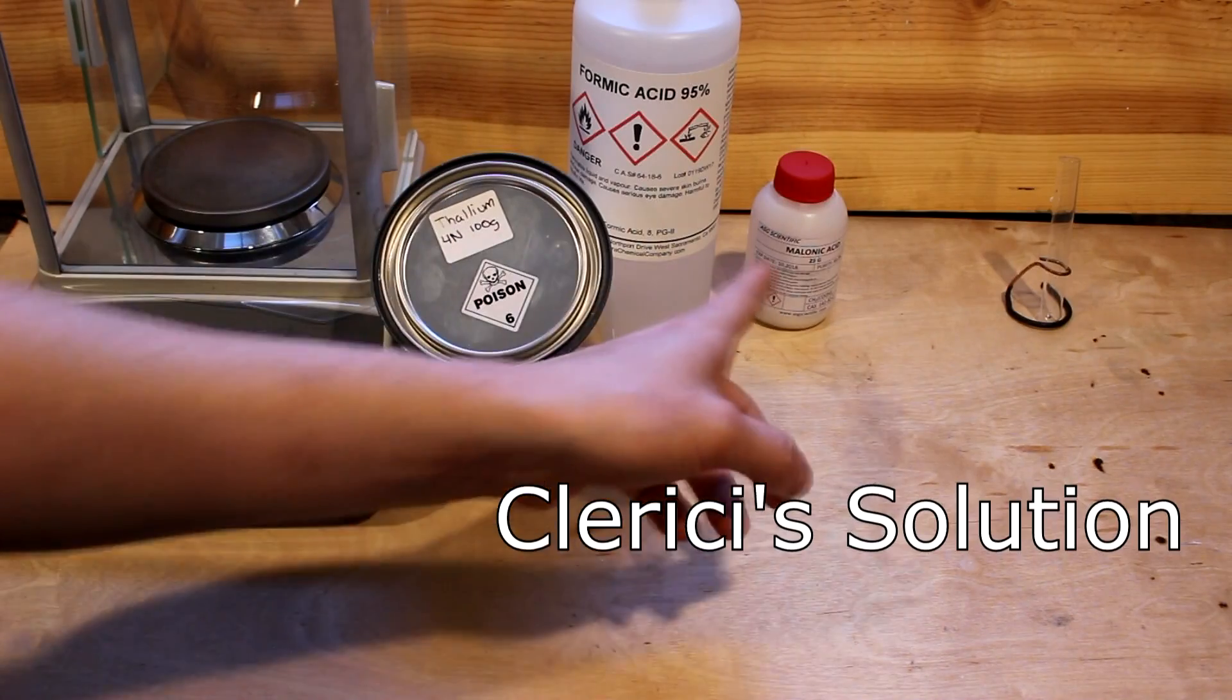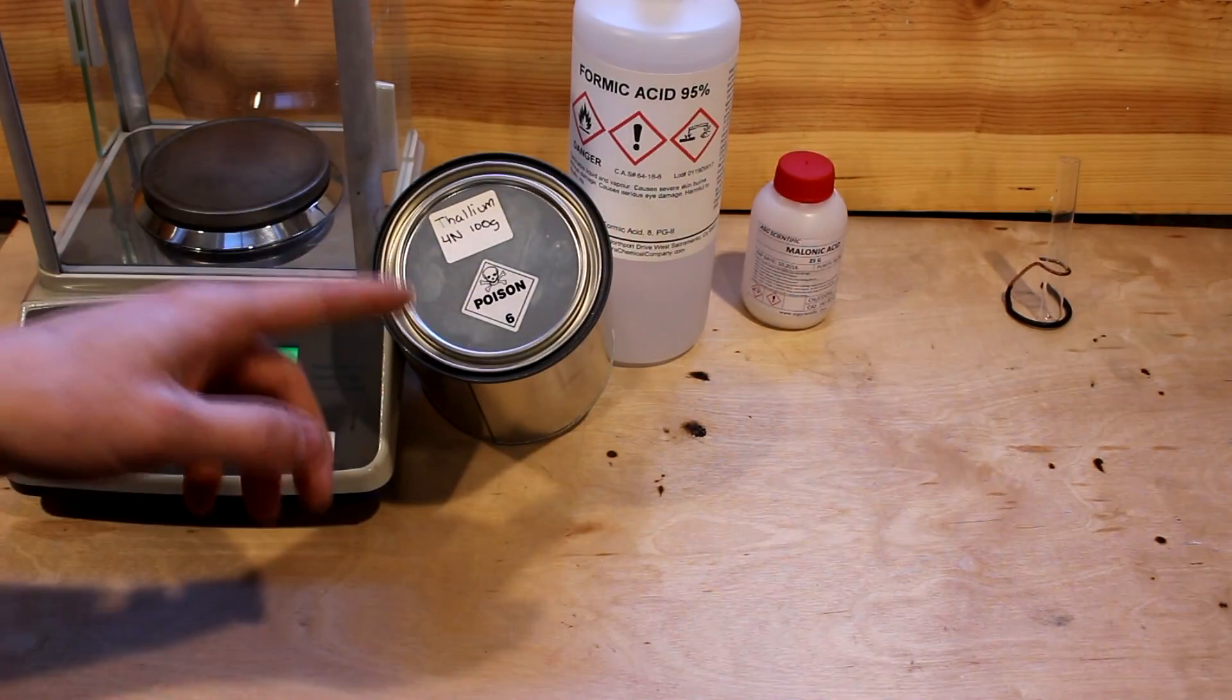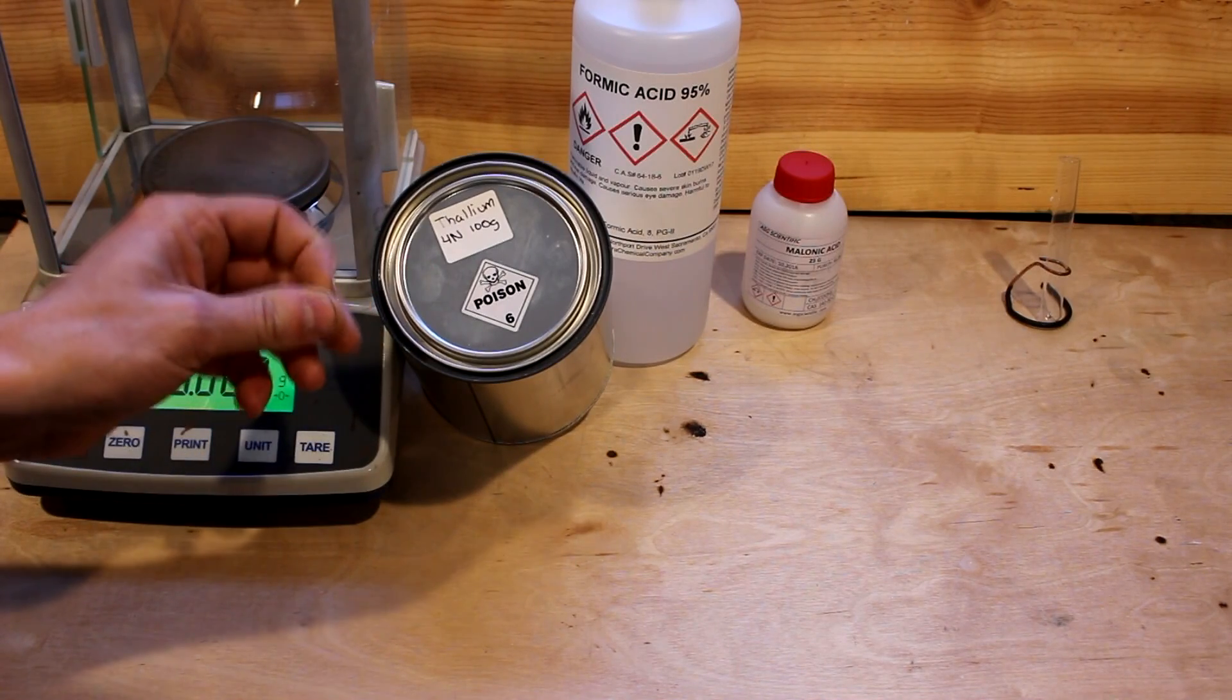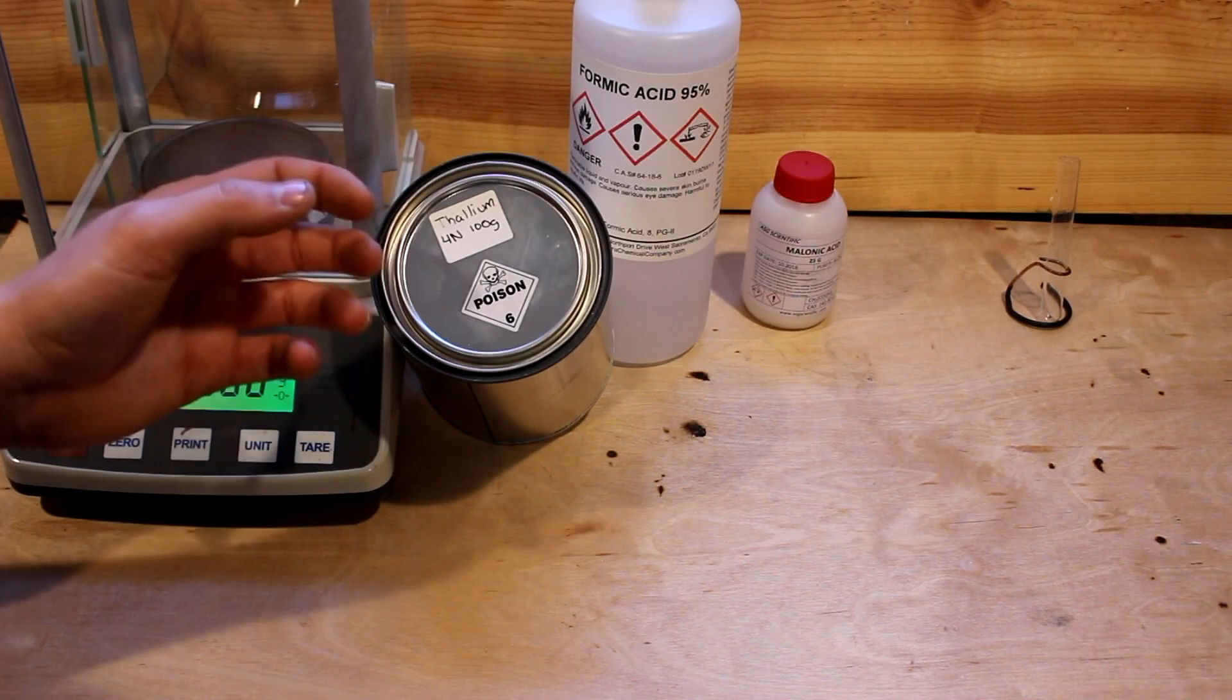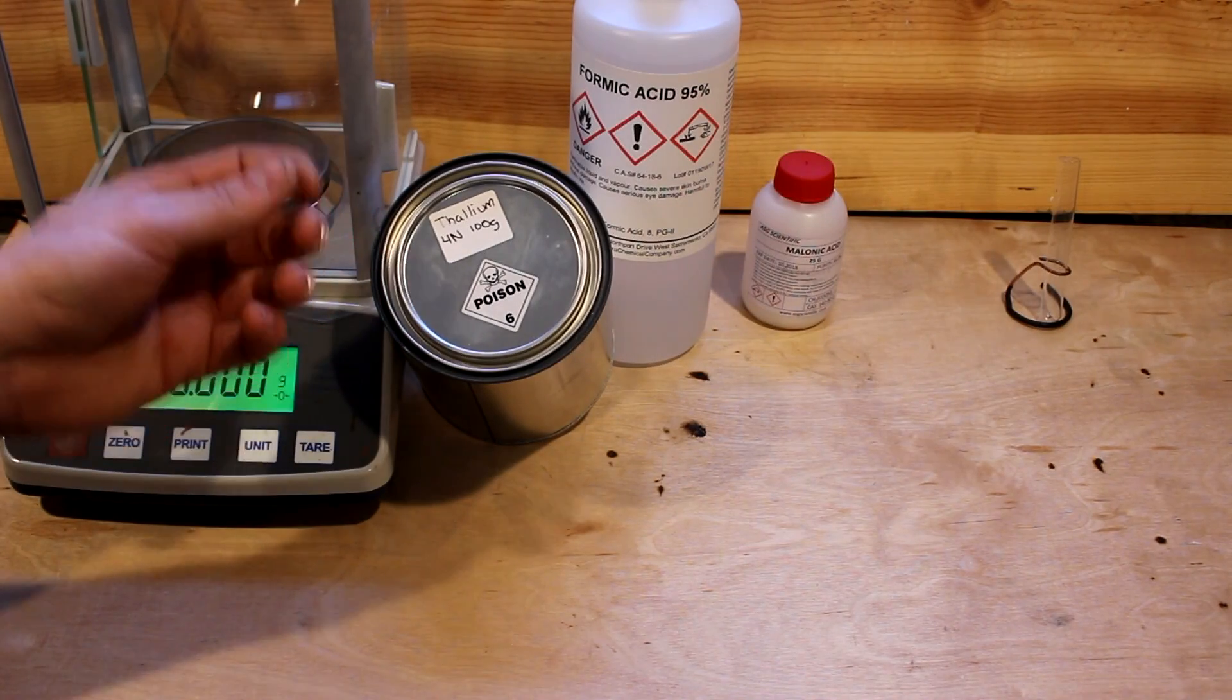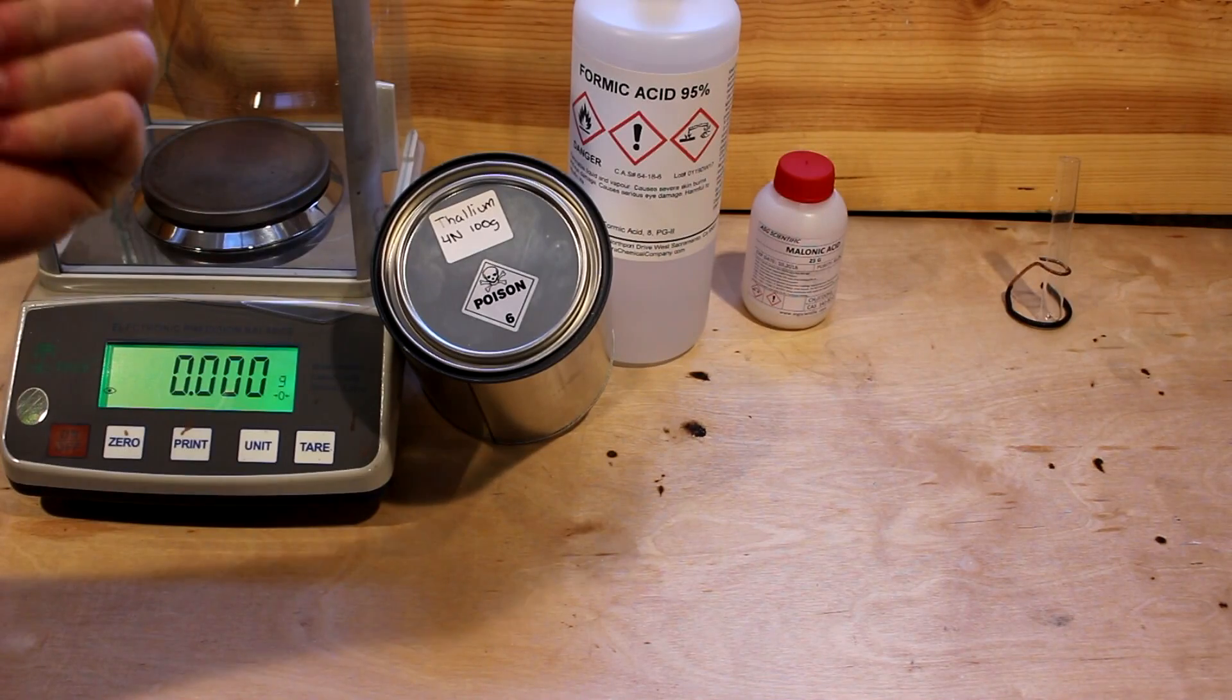This is actually two salts dissolved in water and both of them are thallium-based. Thallium, of course, is well known for its use as rat poison because its salts are tasteless, odorless, and incredibly soluble in water, which makes it very useful for making dense liquids, but also incredibly toxic.